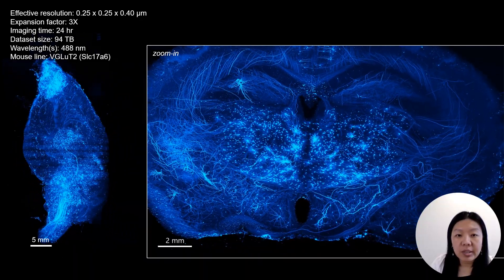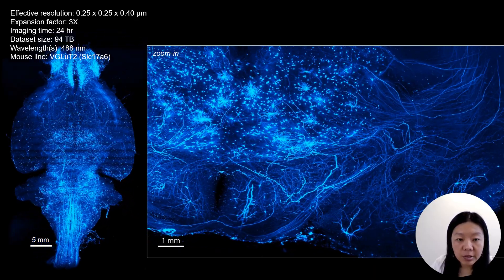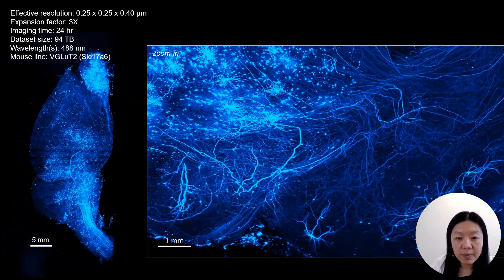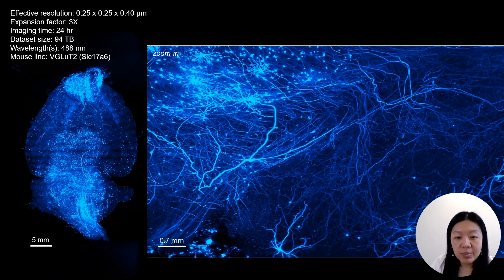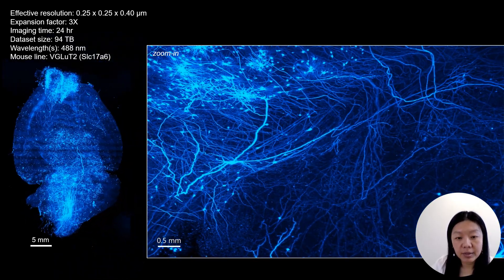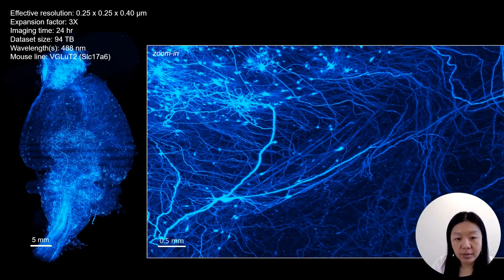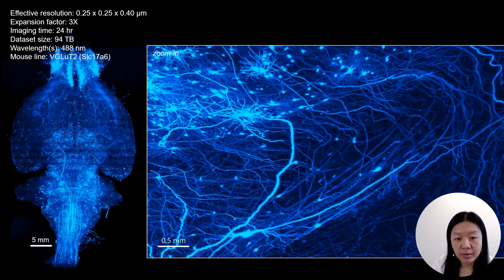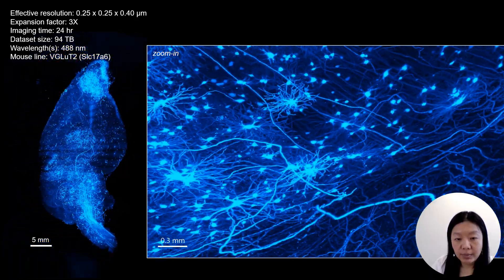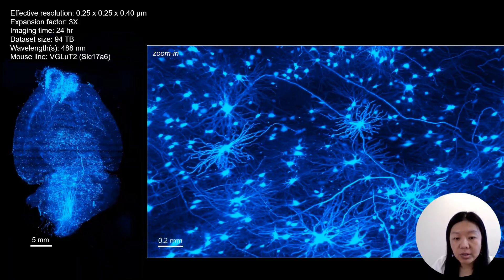Here is another example of a mouse brain imaged under the 488 nm laser. The video goes through different regions of the brain at higher resolution.